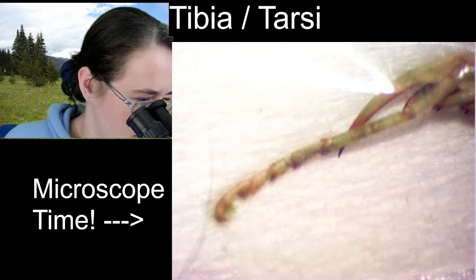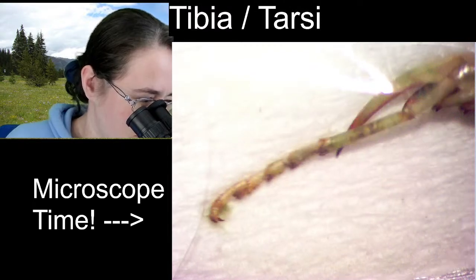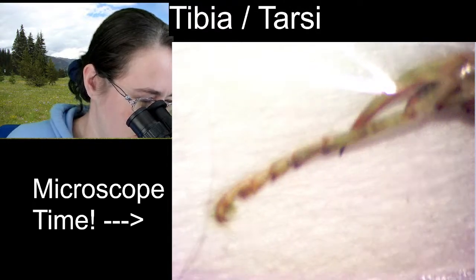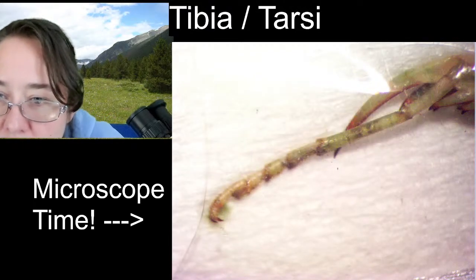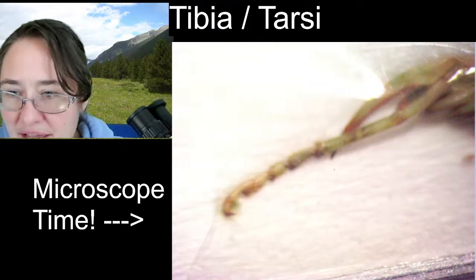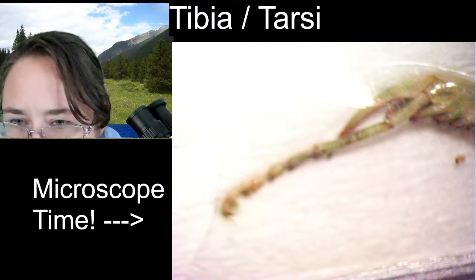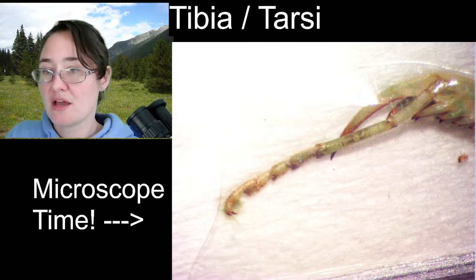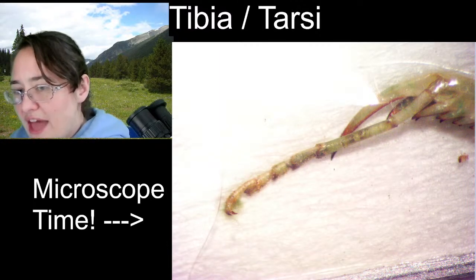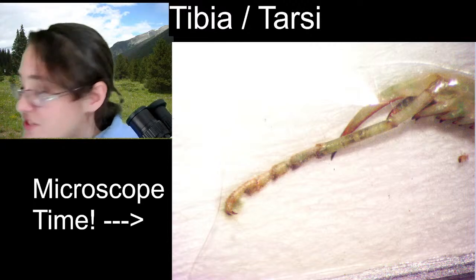One, two, one, two, three, four, five, six. I am seeing six tarsal segments here. One, two, three, four, five, six. All right, so from the end of our tibia here, we have six tarsal segments.